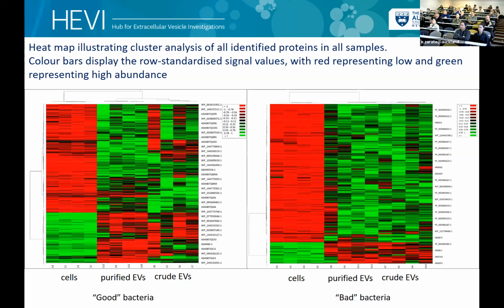We performed proteomics, and first we looked at the heat map, or how the samples clustered together or separated from each other. The interesting thing that we noticed with the clustering pattern was that there were two distinctive groups of proteins present, for example, in the cell group that formed two big clusters. And the pattern of the vesicles cluster was almost inverted.